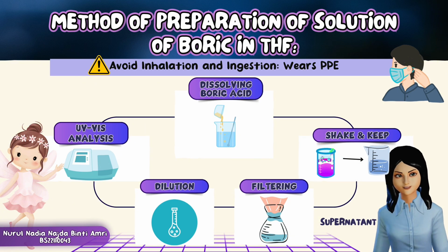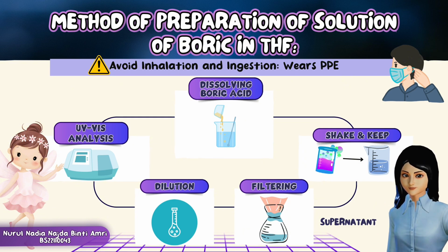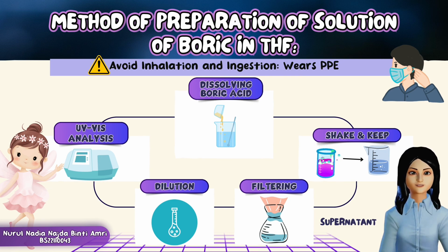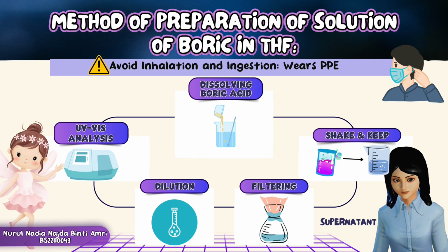0.2 M HCl solution, ethanol, methanol, glacial acetic acid, THF and hexane. It was observed that water, 0.2 M HCl solution, ethanol and methanol were completely soluble, whereas glacial acetic acid is partially soluble and THF and hexane are very slightly soluble.